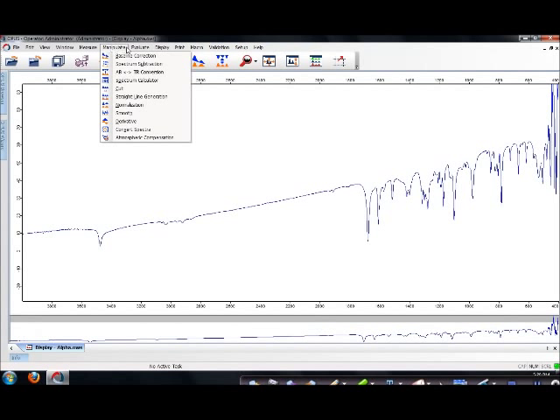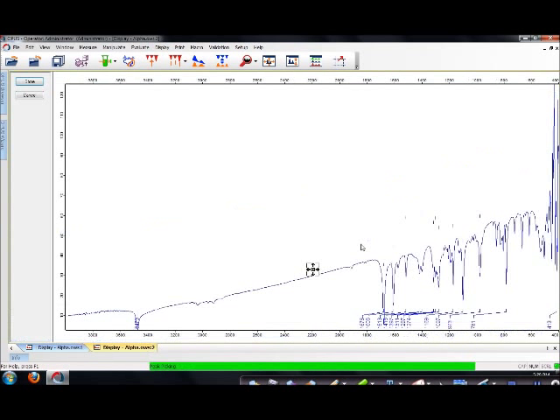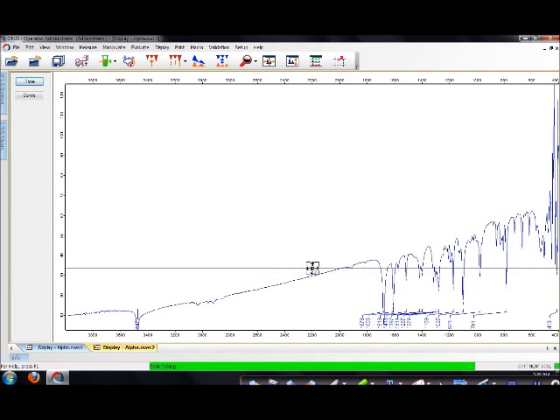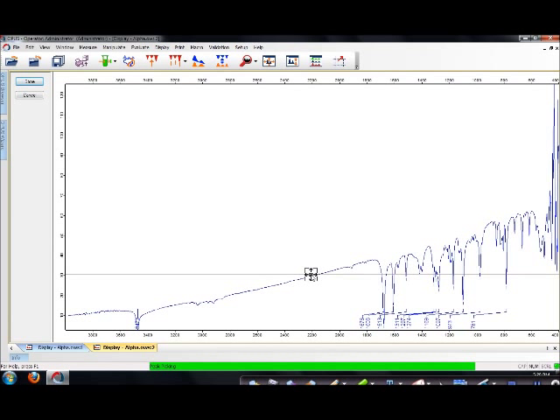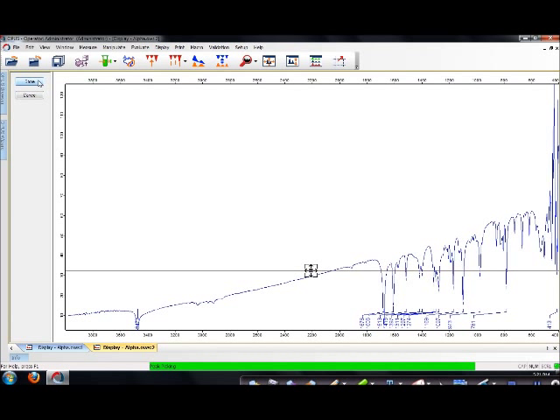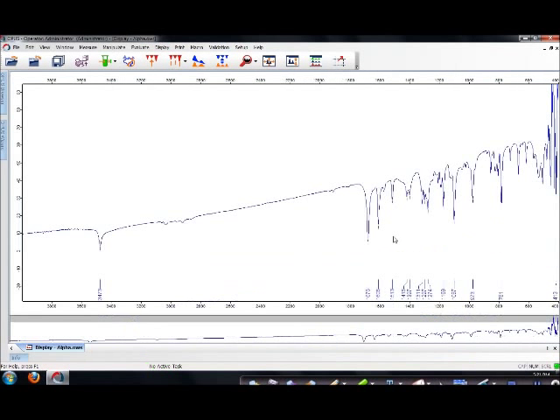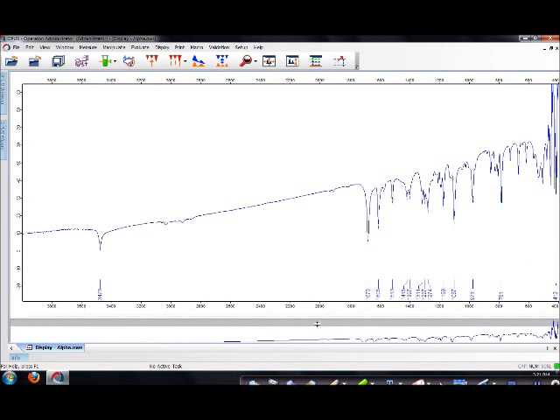Scroll down, Peak Picking. This is like a semi-automatic peak picking. So you can see there's this brown line on the horizon. You can position it up and down and you see that there's more or fewer peaks being shown. So you can adjust it to see the sensitivity of the peak picking. It's all up to you. Once you're happy with the peaks that you have, you can click the Store button on the left column. This will save all the peaks that you have done just now.